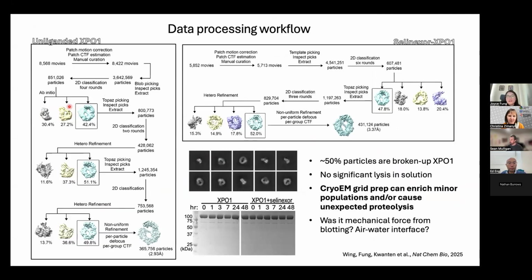I don't think it's not degradation because it's clearly just breaking into two pieces. It's quite crazy. There is a loop right around there, a long loop, and actually, we shorten it for crystallography purposes. So I personally think that loop just got cut somehow. I don't know how. But without the C-terminal helix branching here, maybe we would think that it's unfolding, but it's so well resolved that you can even see this piece completely lined up with this that I don't think it's unfolding.